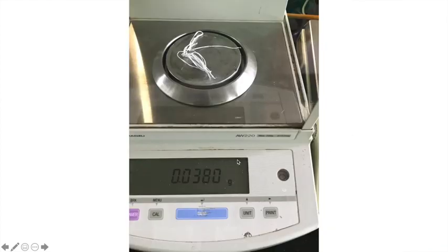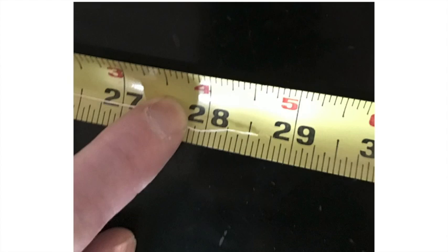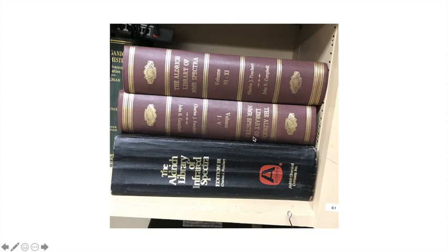So I got my IR here, it's looking pretty good. And then I weighed it out as well. And that strand I had was 0.0380 grams. So like, what's that? 1, 2, 3, 38 milligrams. And then I measured out the length of it. It turns out it's about 28 5/8 inches long.